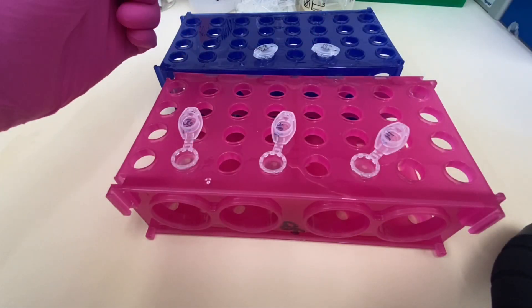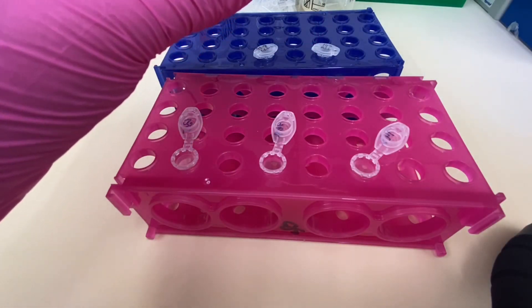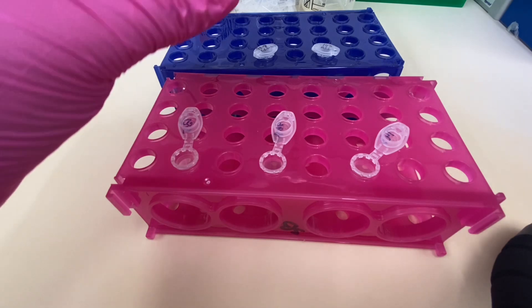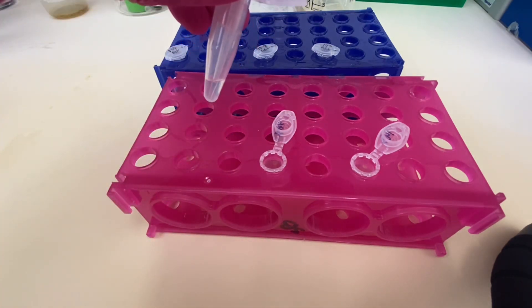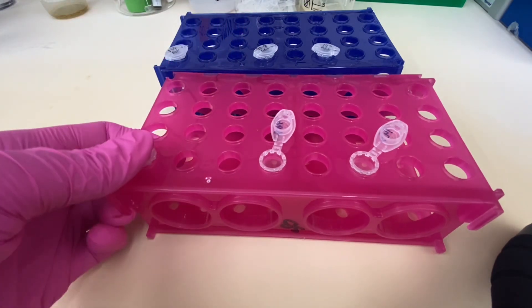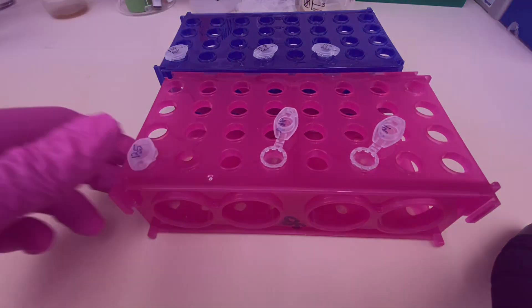After the buffer is in the tubes, now I'm going to add 5 microliters of my samples to each of the tubes. I always like adding the solution that has a higher volume first. In this case, it's the buffer. That way I'm convinced that I'm mixing things properly.